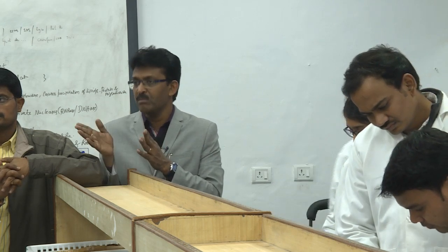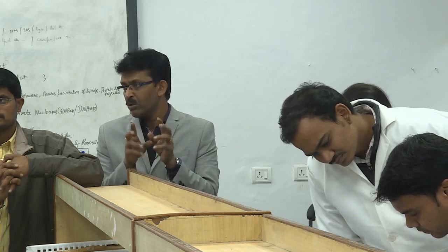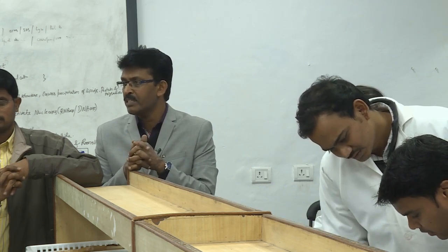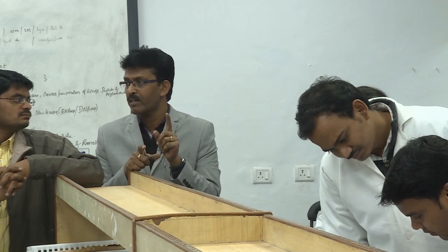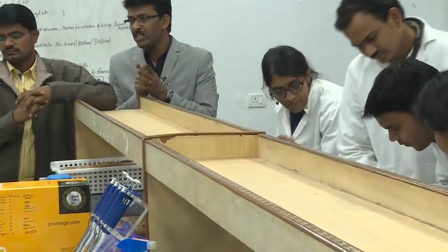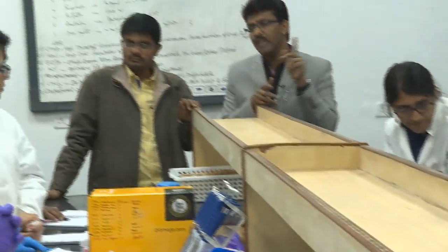No, she might have given the same. She told me also. Fine. So that means Ralstonia and Pseudomonas will go to the same PCR machine. But the Pseudomonas will take 16S ribosomal amplification primers, that is 27F and 1492R. Right? And for Ralstonia, it is fliC. Please check it. One of the housekeeping genes of Ralstonia you take, and these two samples will go to a single PCR machine.